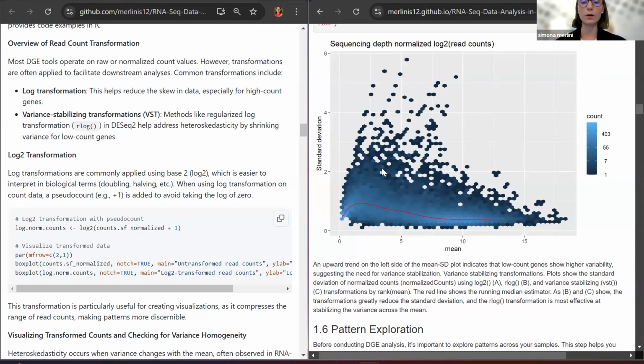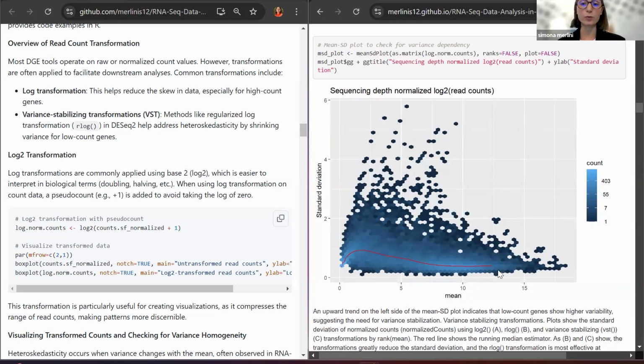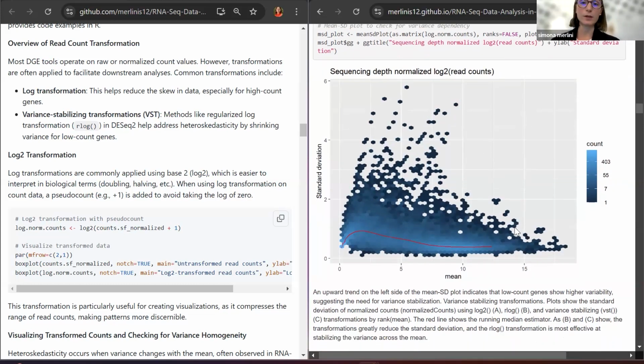What usually people do is just plot a subsample in order to look if this subsample follows the distribution of the data. Here I plotted all of them in order to see how they look.